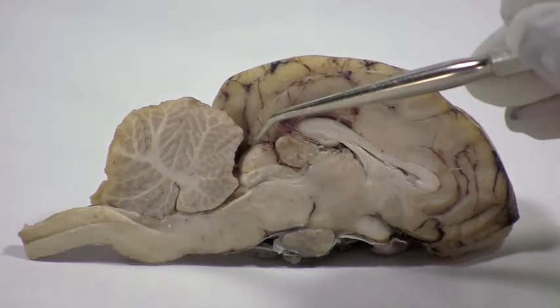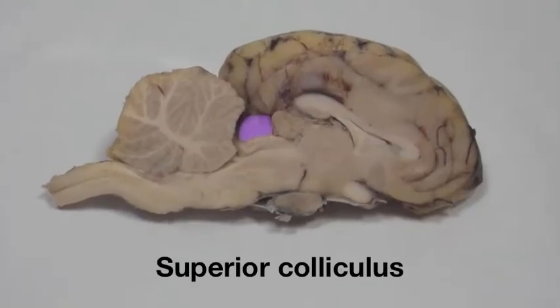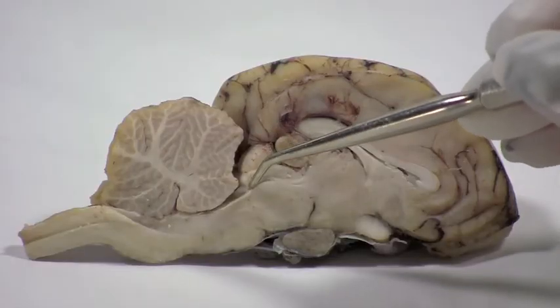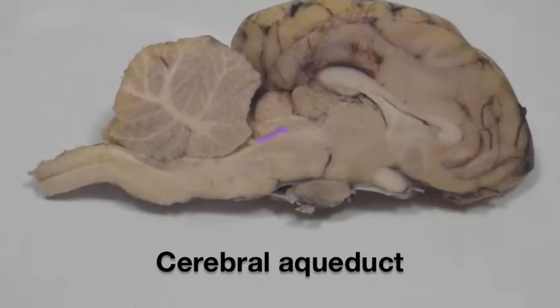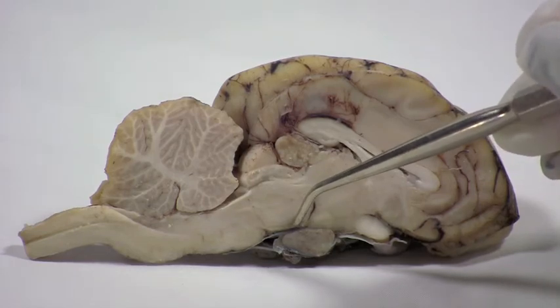We can see a superior colliculus. Here is the cerebral aqueduct, which is contained within the midbrain. Here is a cerebral peduncle, which means little foot of the cerebrum.